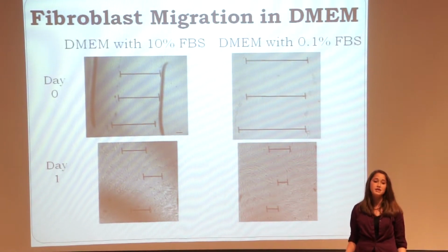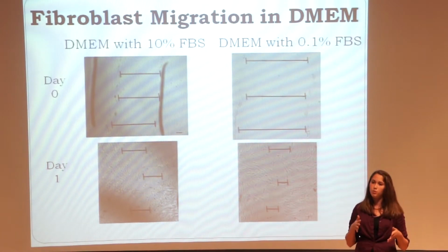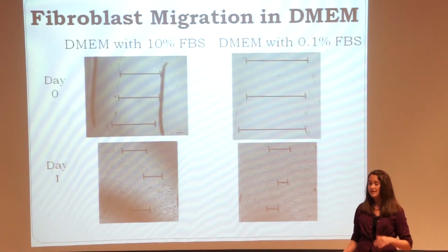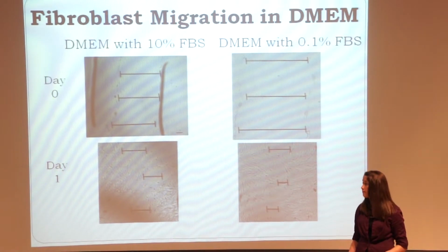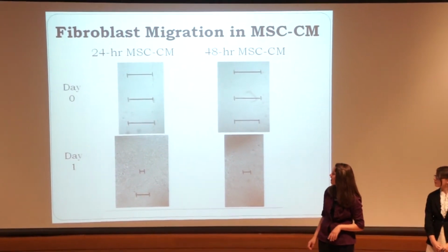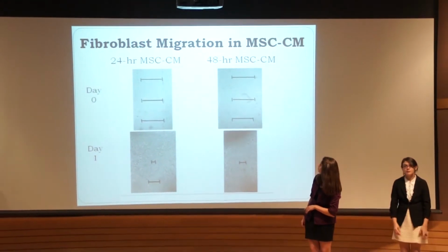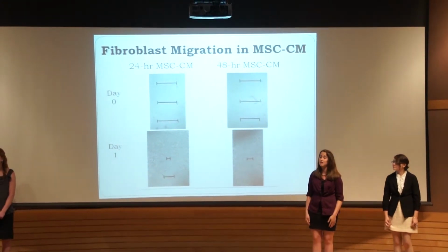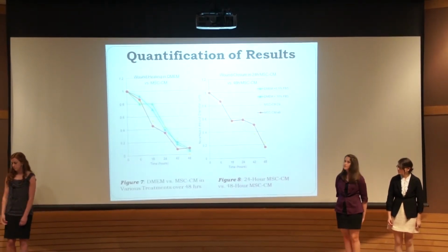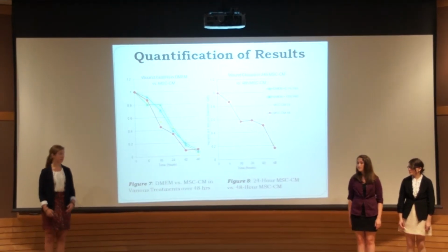And so we used 3 axes so that we could average them to see how much the wound closed, because some parts of the wound closed more than others, depending on the fibroblast, and also so that we would be consistent with which part of the wound was closing. It can also just be noted that even before day 2 of the experiment, some parts of the wounds with the stem cell media actually completely closed. So as we predicted, the fibroblasts in the stem cell media migrated faster than those in the DMEM or the variant in our control media.